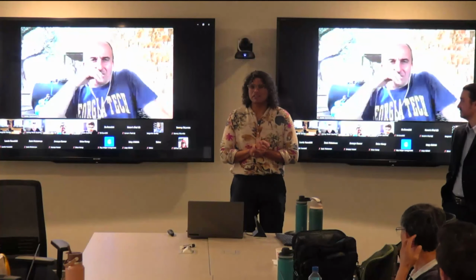So we can see small things on ARTiMiS, but the question is, how do we get more detail out of that? How do we turn that into useful information? We're focused here on specific events. Events is anything that appears in our field of view, and we want to isolate them from the background in order to study them more closely.